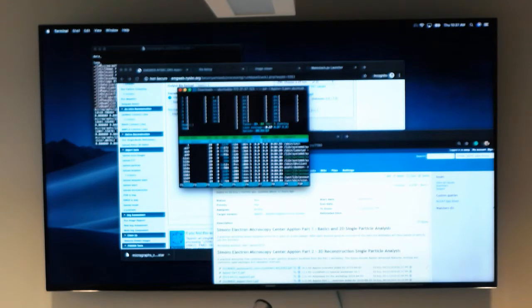Okay, so this is useful to know because when you're running any program, you need to know your computational environment. Every group has their own instance, and you'll feel free to play.